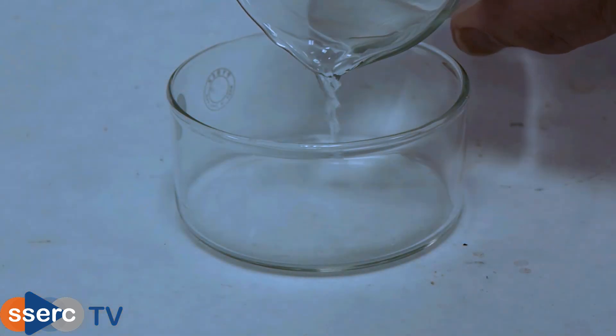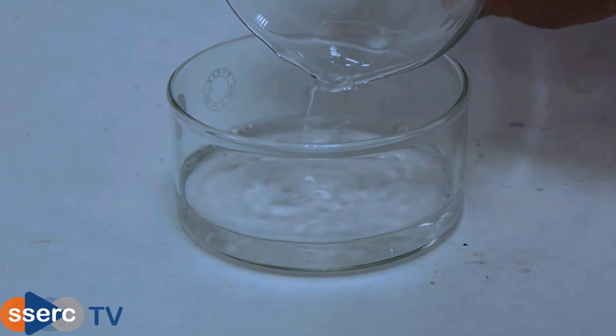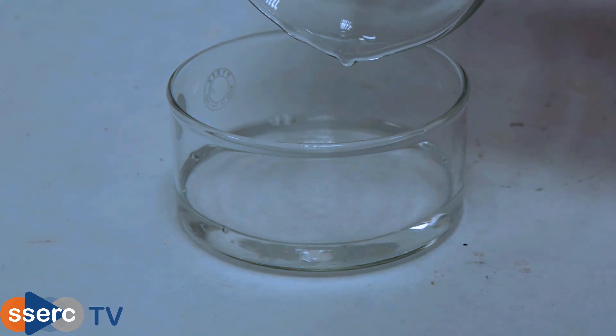Decant the now dry ethyl ethanoate solution into an evaporating basin or crystallising dish and place somewhere warm for the solvent to evaporate.